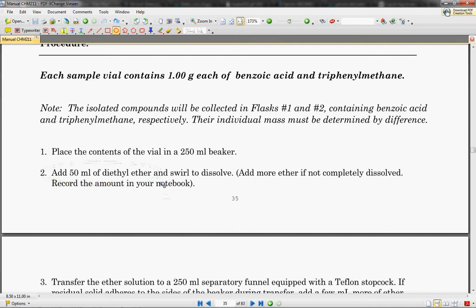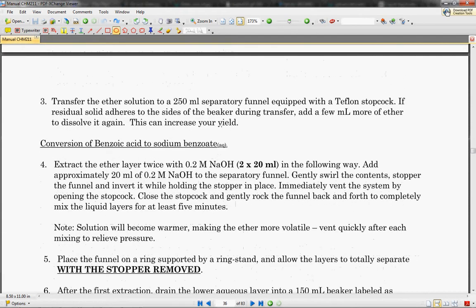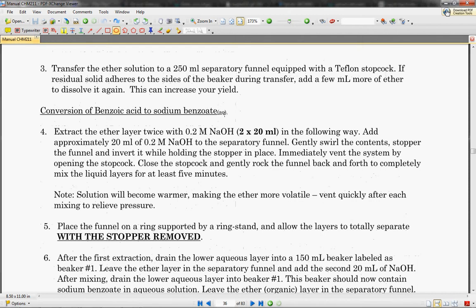It's basically the ether that people inhale to fall asleep. It used to be used like a painkiller, and I think as an anesthetic as well. So don't breathe in the ether, or you might end up falling asleep in class or in lab.